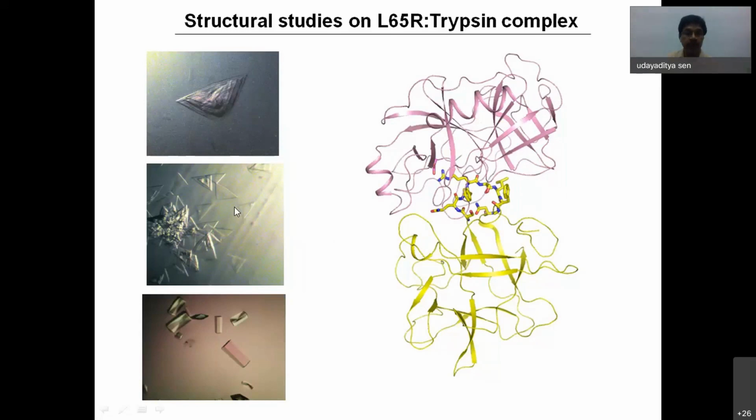after 3 or 4 days, one drop I touched the crystal and seeded it. Then 4th day or 5th day, another drop I seeded it. Then 7th day, another drop I seeded it. So in that way, on 8th day, I saw the seeds grew up. I touched the crystal with a loop, and another drop I touched over here, and away from this thing, I see nice shaped crystal, triangular crystal as there.